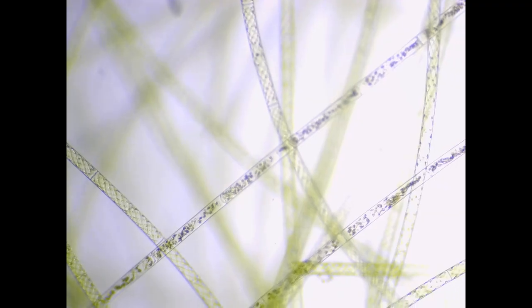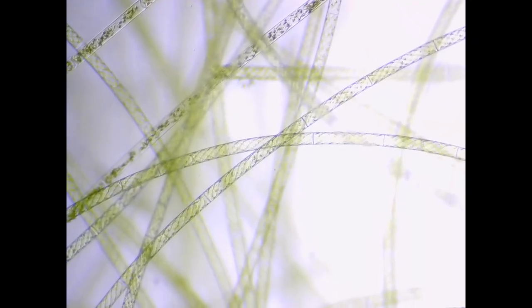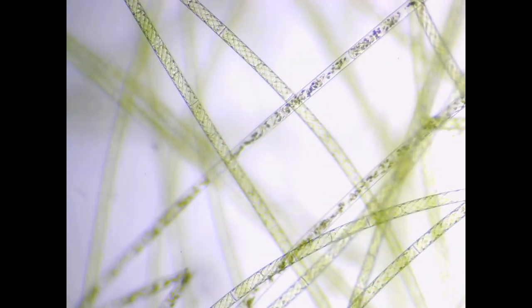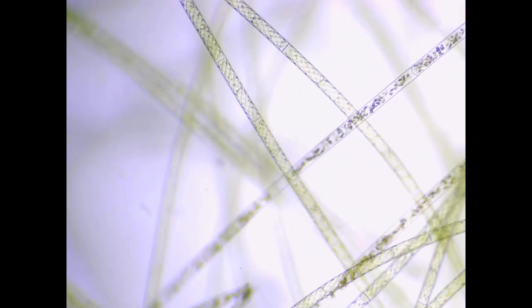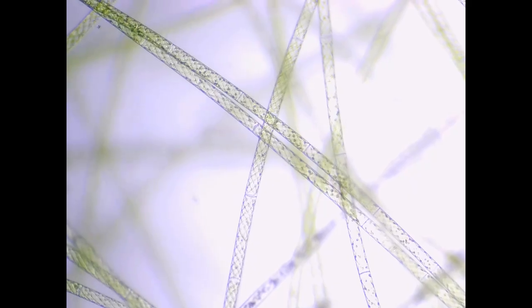Spirogyra is a genus of filamentous green algae, known for its beautiful spiral-shaped chloroplasts. They consist of long-chain filaments of identical cylindrical cells. Cells are surrounded by a mucilaginous sheath. Each cell typically has one or more helical or spiral chloroplasts, containing pyrenoids, which are centers for starch formation.